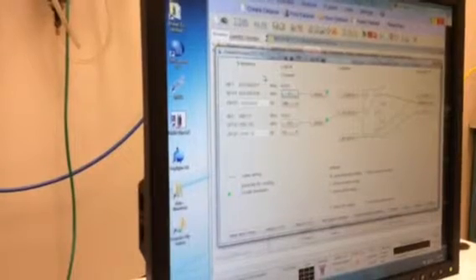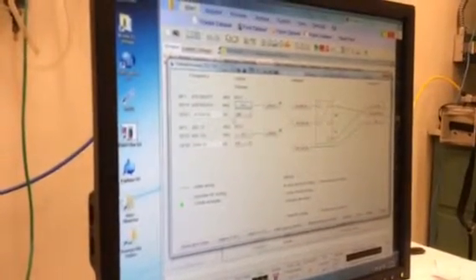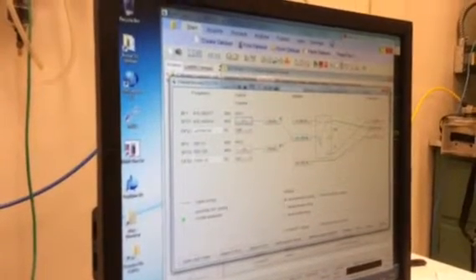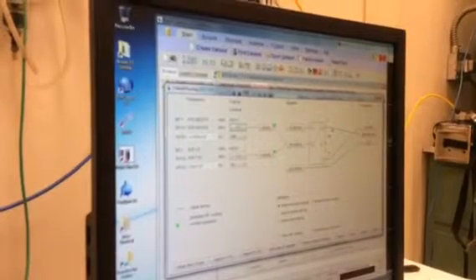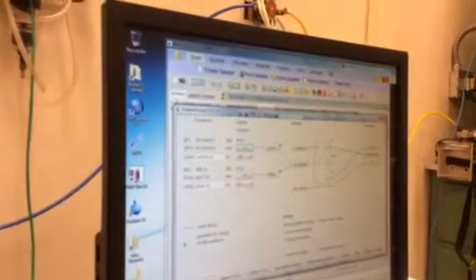So I'll show you in just a second. So if you can type EDASP, we're going to have a look at the routing display in it. Okay, good, it does. So this shows how everything is working. All right, so we have our F19 nucleus going through the X channel F19. Okay, this looks a little funky to me though.